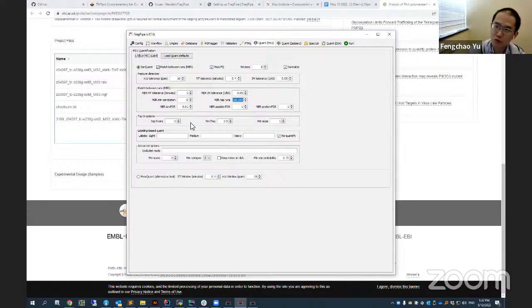In the future version, if you check max LFQ, we will print both top N intensity and max LFQ intensity in the version that we are going to release in a week.